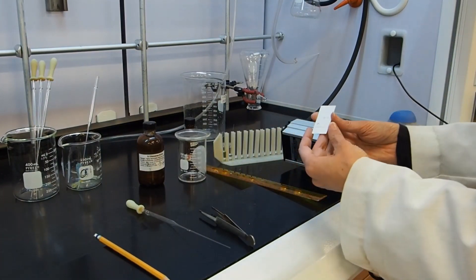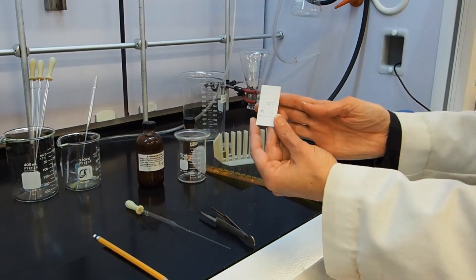If you would like to see the TLC, this is what it looks like.